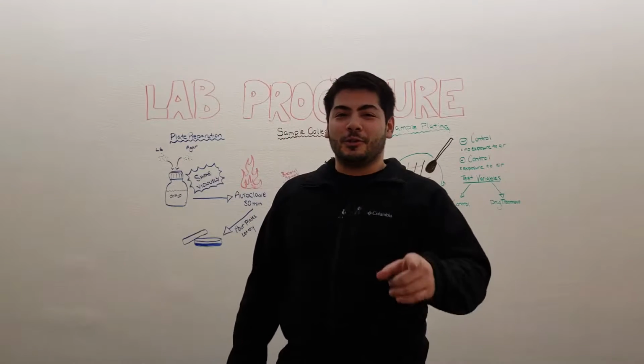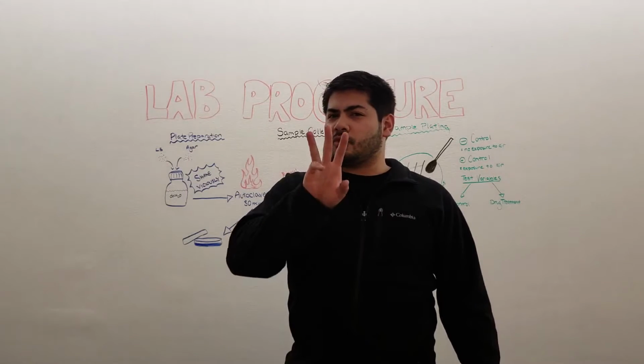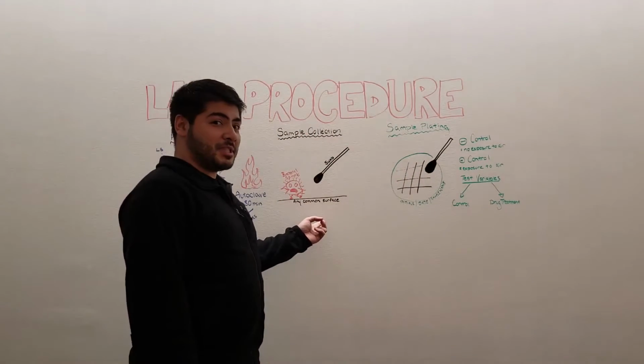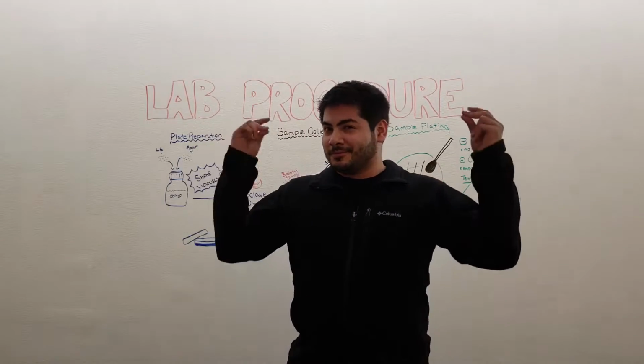Today, I'm going to be your virtual lab instructor for a bacterial growth experiment. We're going to do this experiment in 3 simple phases. First, we're going to make our nutrient agar plates. Second, we're going to collect some samples. And third, we're going to plate those samples. So let's get to the lab.